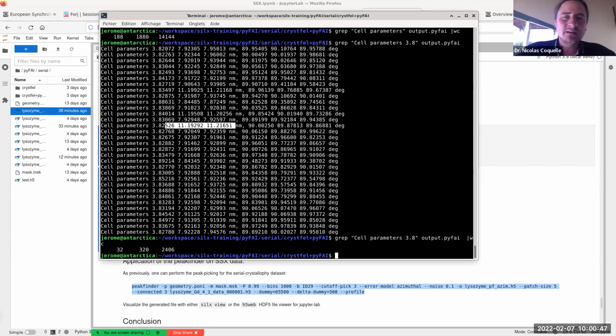Maybe I'll contact you to see if you find ways to implement this via ZMQ, because we are at a stage where we have the peaks kind of live. We can follow up at 250 Hertz on the Pilatus, but we would like to have direct feedback on the indexing, for example.